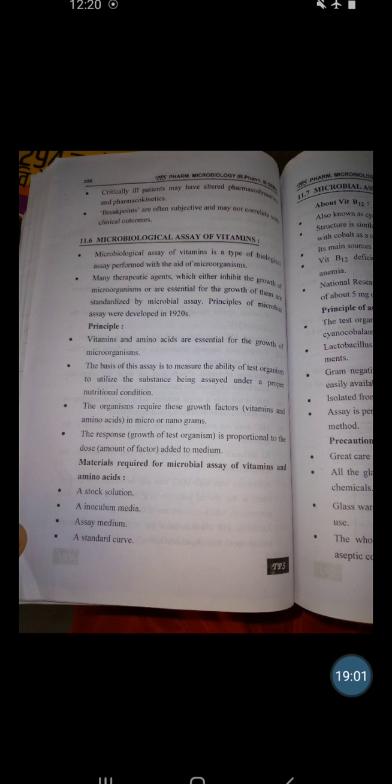Next, we will see the microbiological assay of vitamins. The microbiological assay of vitamins is a type of biological assay performed with the aid of microorganisms. Many therapeutic agents which either inhibit the growth of microorganisms or are essential for their growth are standardized by microbiological assay or microbial assay.